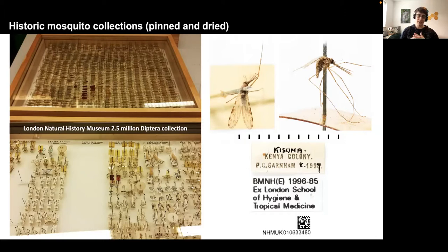Preferably, but that's rarely the case, some entomologists have also done proper field studies and field books of these samples, so you can get a bit more data on other things. But at the end of the day, you're mostly working with what's on this tiny label when pinned insects are in play. And so, as you can see, these are extremely tiny, extremely valuable samples.